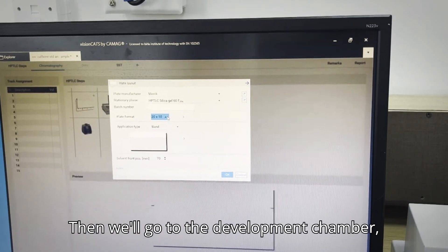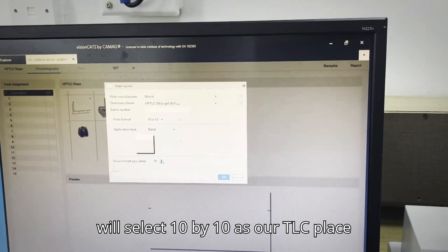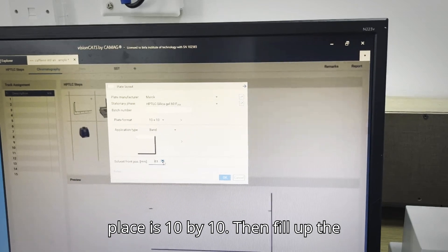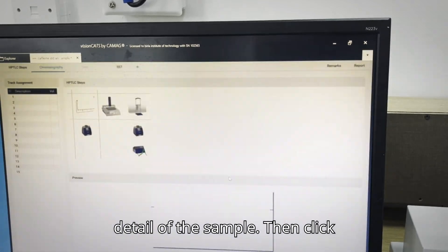Then we will go to the development chamber. We will select 10 by 10 as our TLC plate is 10 by 10. Then fill up the detail of the sample. Then click OK.